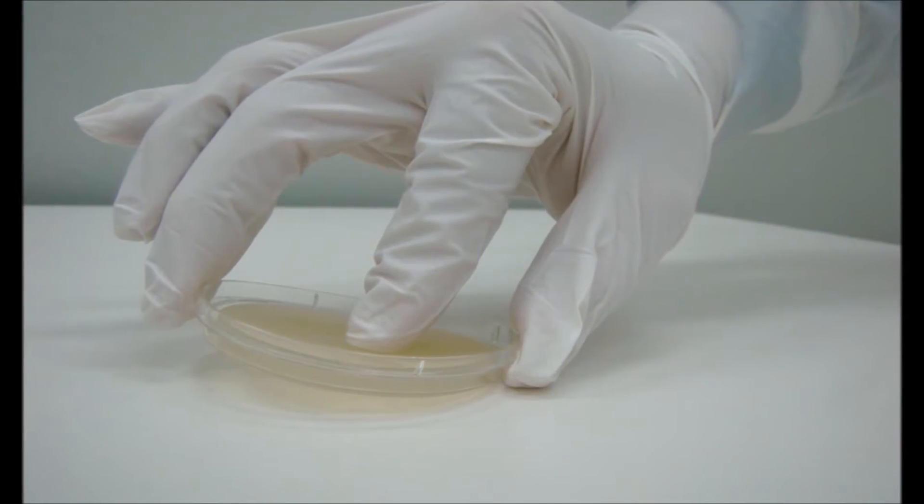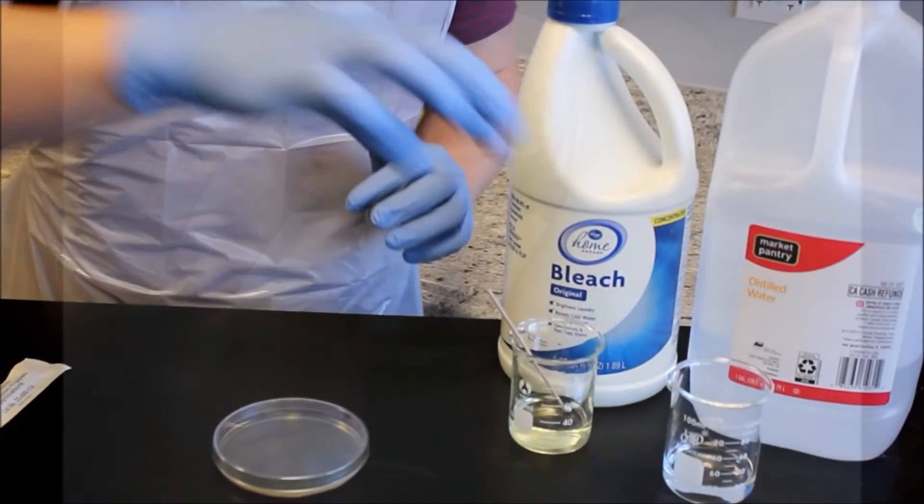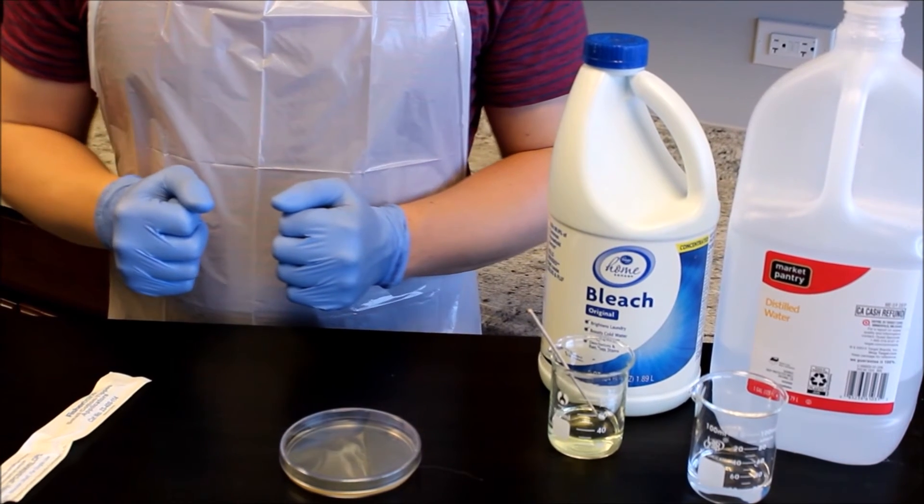Store the agar plate agar side up in the incubation location. Allow the swab to soak in bleach for two hours prior to disposal.